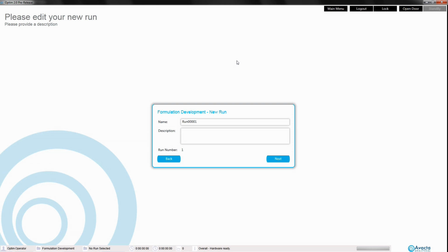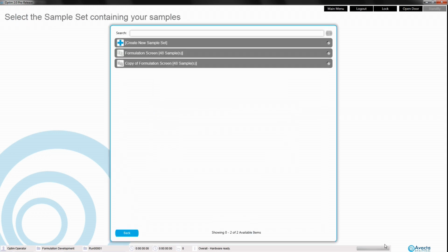We can then choose a project, provide some information so that we can refer back to this run in the future before going on to some bookkeeping. Creating records for the samples that we measure will allow us to analyse interesting features and trends about our samples when we perform the analysis on the data. Each collection of samples is called a set. We can group samples together in a sample set to use in an experiment.